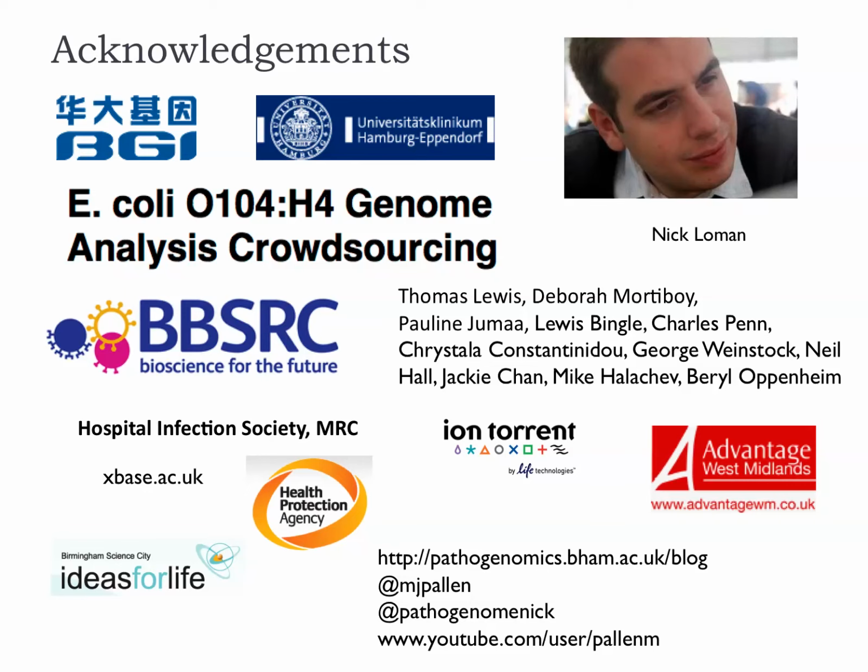We haven't, because when we started looking, we thought, well, maybe we could take receipt of the samples, and then we thought, no, we don't want to fly STEC containing feces across international borders. It's going to create an awful lot of safety problems and customs and import. You know, what have you got in your bag? I've got some highly infectious STEC. Yeah. So we said, well, we'll just take receipt of the DNA.